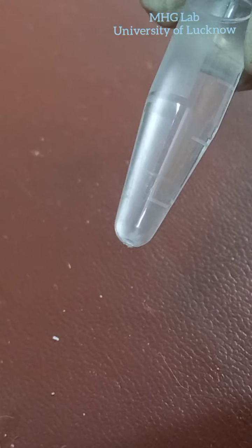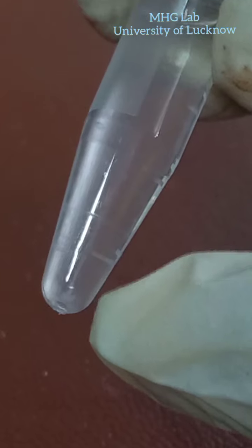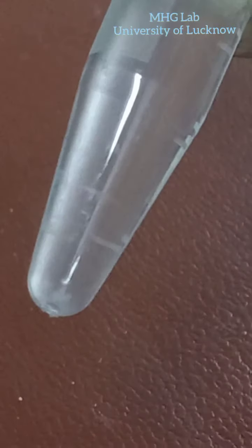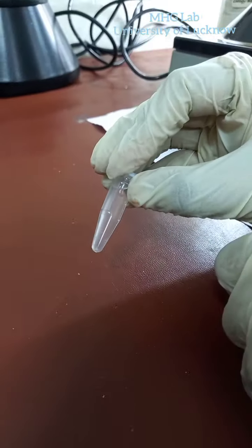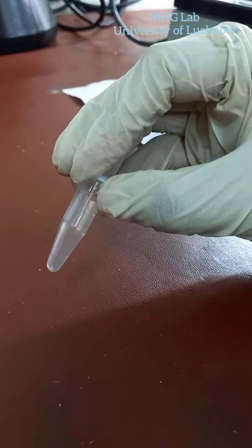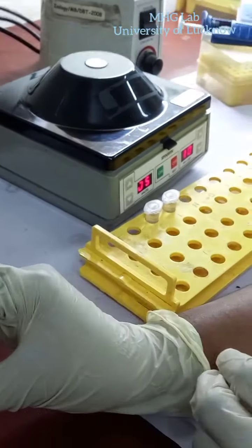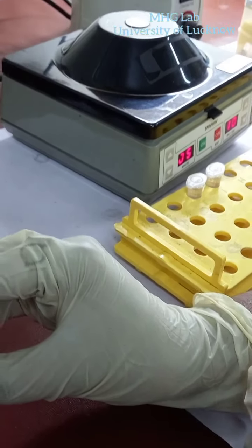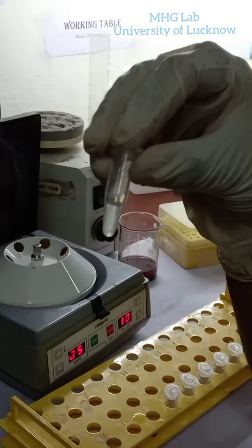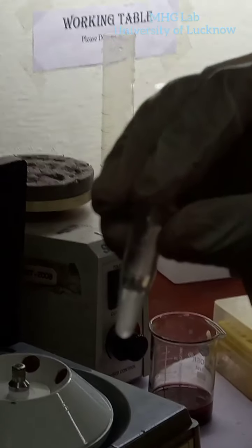Now we will discard all the alcohol. This white spot is the DNA. We will discard all the alcohol and wash it with 70% alcohol for 2 times. Let it dry overnight, and then the next day we will add 50 mcl of TE buffer to it and let it dissolve at 55 degrees Celsius for 1 hour. Now add 300 mcl of 70% alcohol and wash it for 3 minutes by centrifuge at 10,000 RPM for 3 minutes. After 3 minutes we will discard the 70% alcohol and let it dry at 37 degrees Celsius overnight.